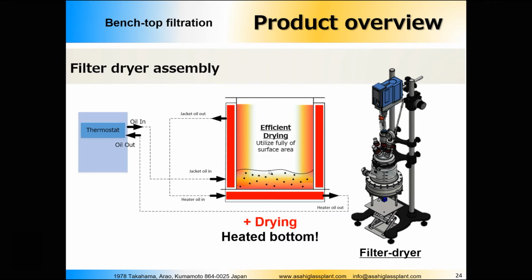In order to mix everything properly and replace the dried substance with a wet substance, like dry will go up and wet go down, we need to stir everything. So this is why we need the overhead stirrer, which will continuously rotate the stirrer blades.